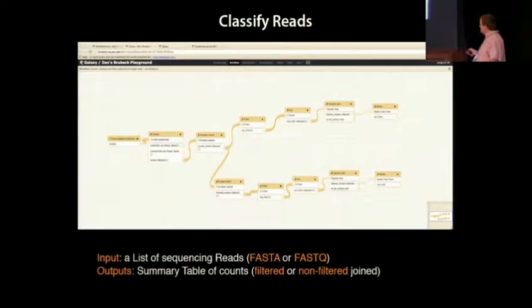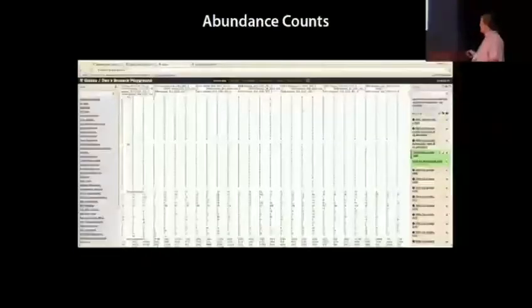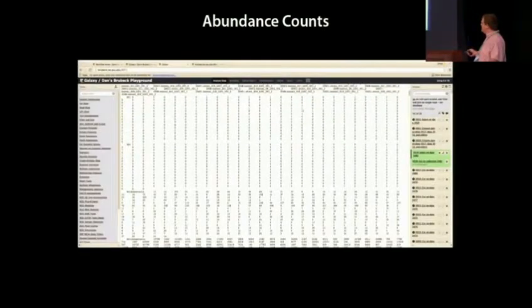So this is just, in general, the Kraken workflow that you can go through. We actually have special tools that allow us to run individual reports from Kraken across our collection, and then we can join on the columns. We end up with the same sort of layout as we did before from the FastQC report, but in this case, we have our samples at the top. We have our groups called on the left first column, and then across the center, we have our actual abundance counts for each sample.